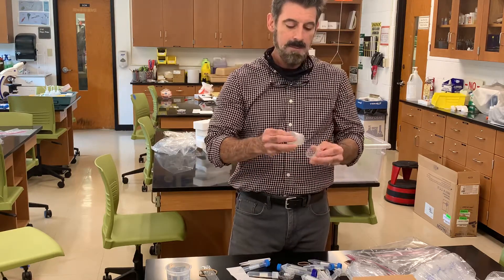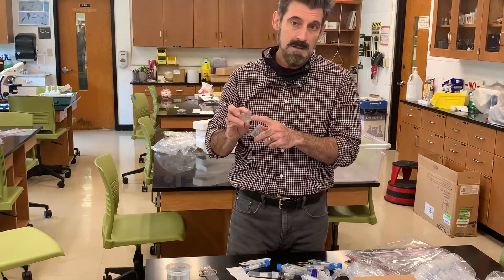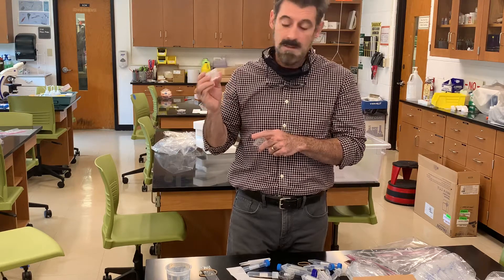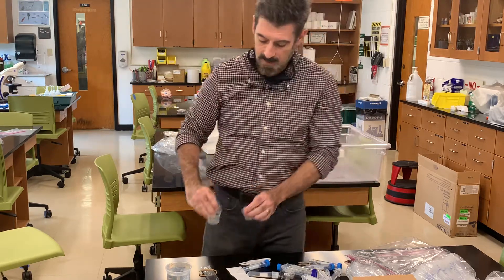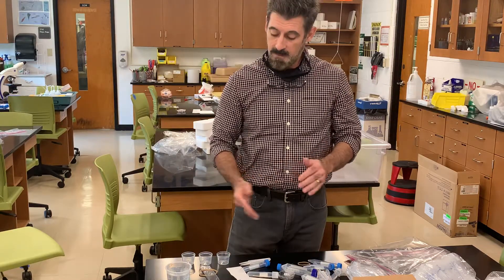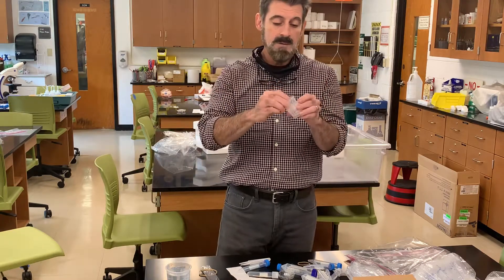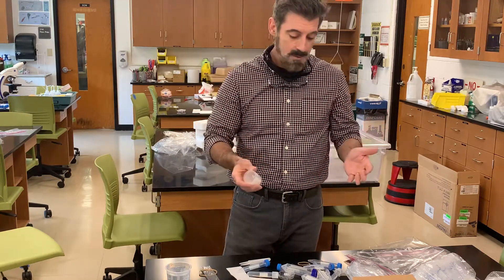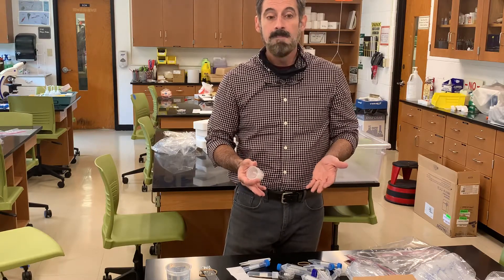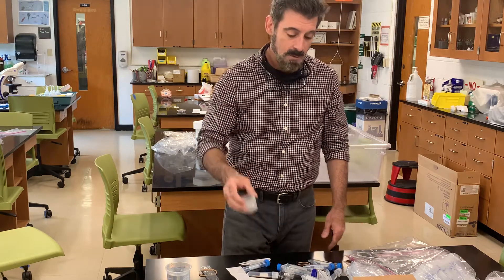Additionally, you're going to have a number of small graduated plastic cups — they have markings that show how much volume is in them, which you'll need to refer to. You might also use them for other experiments where you prepare several different solutions, with each solution going into its own cup. They are reusable. At the end of the semester most items are disposable, but you'll probably keep the balance; the other things can be thrown away — just keep them until the end of the semester.